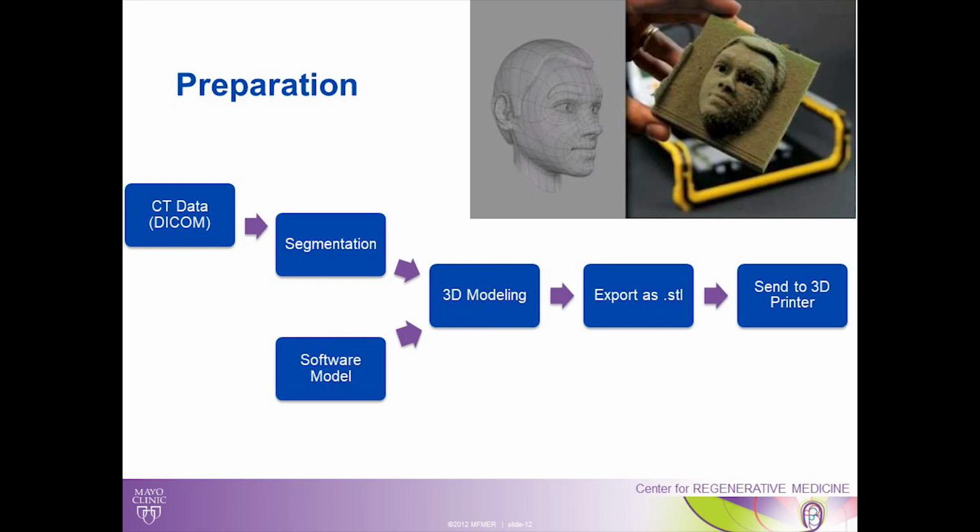Again, now from the preparation standpoint, this is lots of work, and once you get these down, subsequent iterations become much easier, but going through the very first process of it. If you think about taking a CT scan of a patient and then getting that to the point where you can print it, that process also needs to be proved. One of the questions the FDA asked us is, what's the minimum resolution on the CT scan that you can use for this process to be valid?